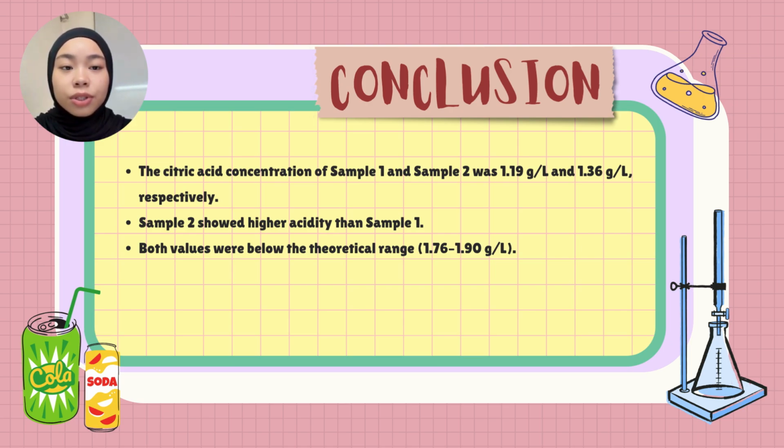However, both concentrations were lower than the theoretical range of 1.76 to 1.90 grams per liter. Overall, this experiment demonstrated that volumetric analysis is an effective and relevant method for determining the acidity of soft drink.